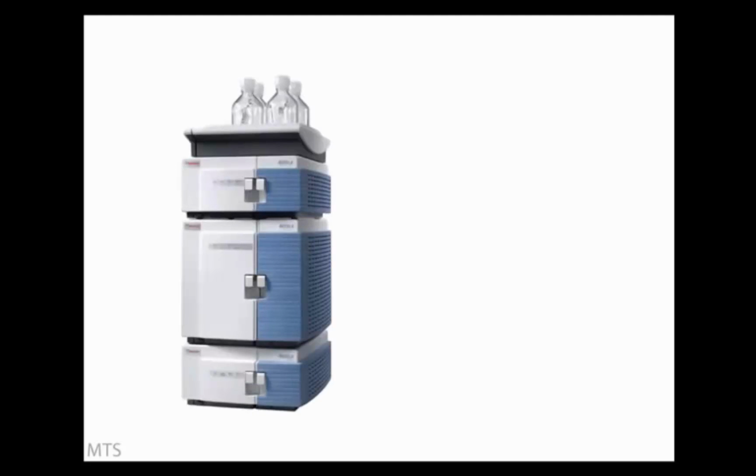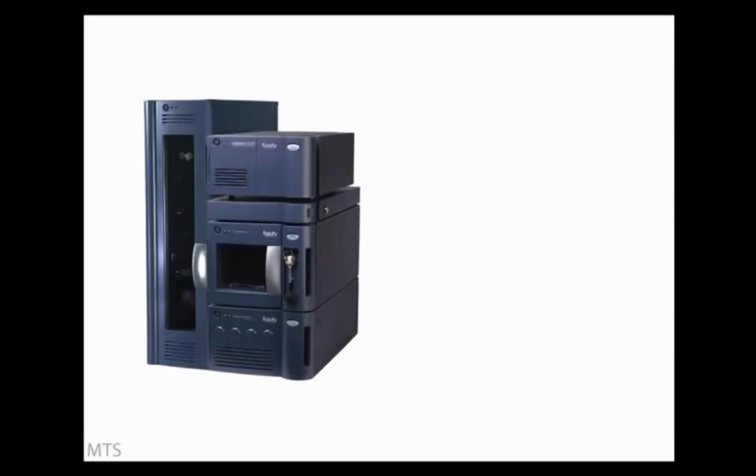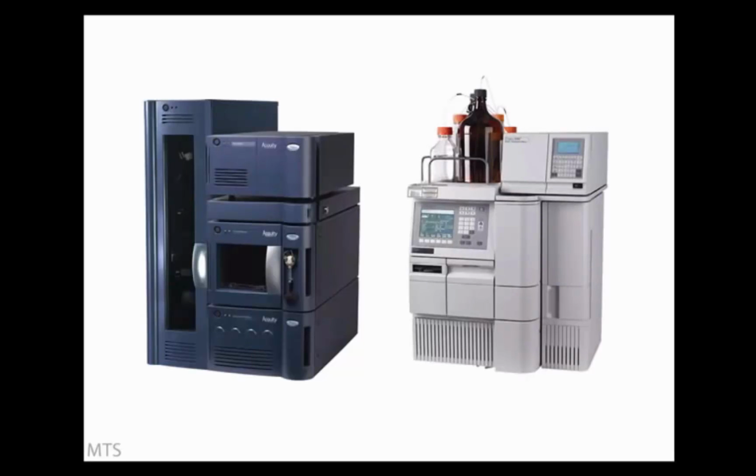A HPLC system can at first glance appear daunting to the new operator. A full understanding of the components common to all HPLCs can transform bewilderment regarding a complicated arrangement of tubing and electronics into an appreciation of a logical and well-designed piece of analytical equipment.